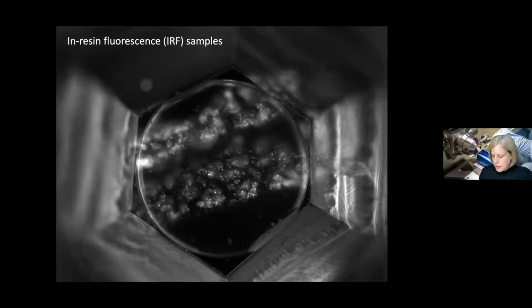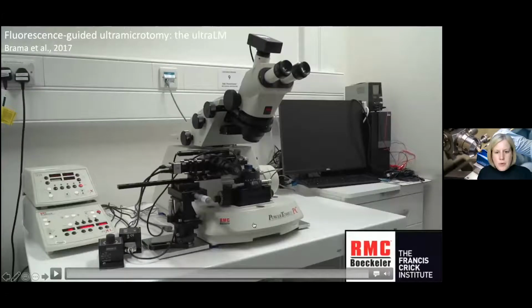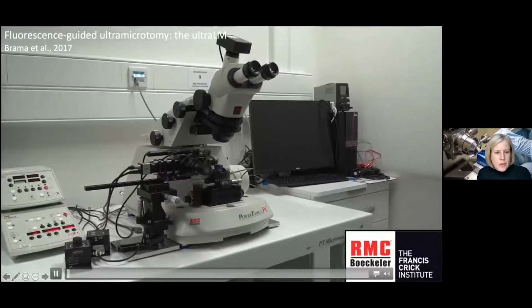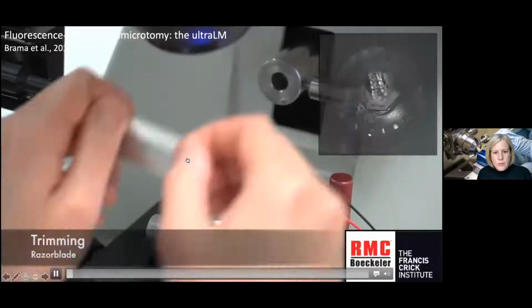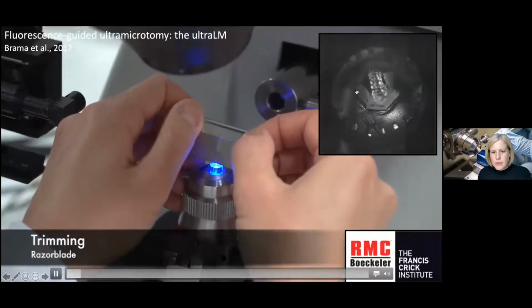microscope. So cutting a very long story short, the microscopy prototyping team in the lab designed a miniaturized fluorescence microscope and integrated it into an ultramicrotome. And just having a quick look at how it works. So we can illuminate the block so you can see the cells to trim down to the region of interest.